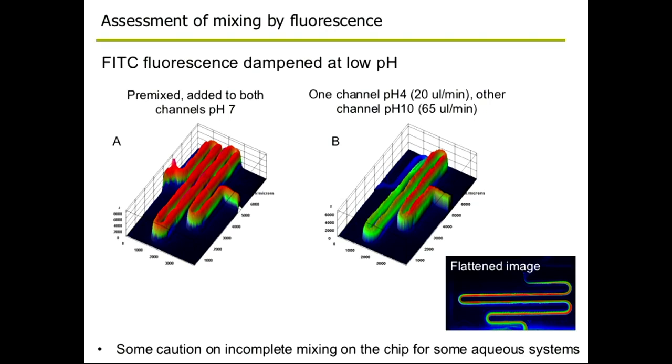And so Linda then went away and thought, well, if we're going to think about this in a digestion sense, what we're really going to have is an aqueous phase and an aqueous phase. So perhaps the mismatch in viscosities isn't such an issue when you're in that sort of a regime.